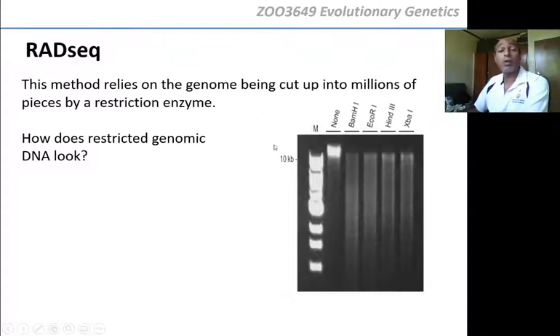Which way did the DNA run? It went to the positive side here, because DNA is what? Negatively charged. And you also know that the big pieces were slow going through the gel, right? And the small pieces were fast going through the gel. So now, here's the positive side, where all the DNA was busy running. They started here. They ran here. So, where are the small pieces on this picture? Down here are all the small pieces of DNA. Here, in the middle, are all the medium-sized pieces of DNA. And here are all the big pieces of DNA up the top here.